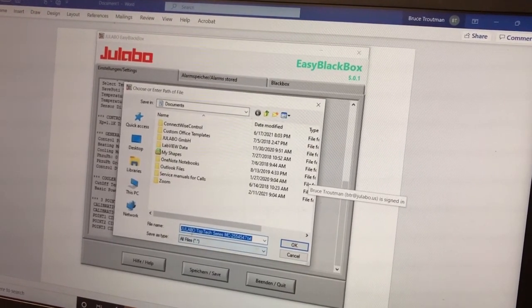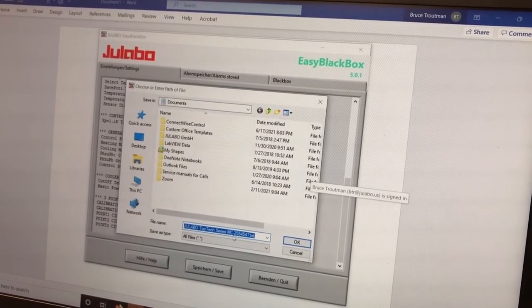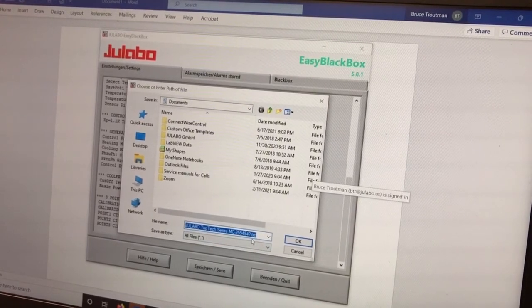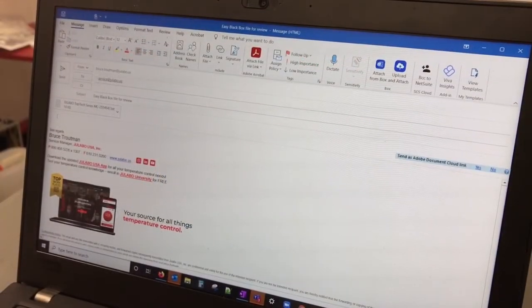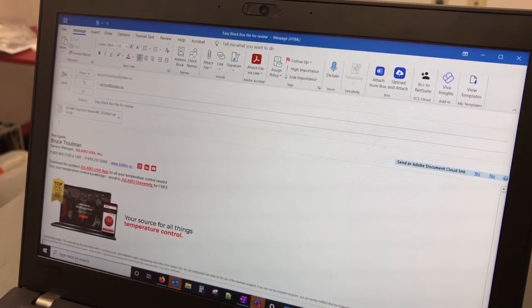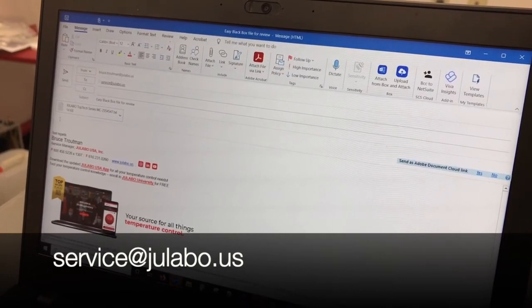You'll notice on the saved file it will have the model name, what type of series it is, what type of circulator head, and also the barcode number. Notice it's a .txt file. Once you have the file saved, simply compose an email and send the downloaded text file to service@julabo.us for further evaluation.